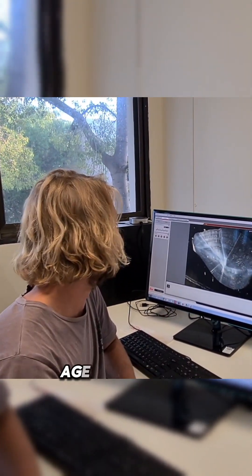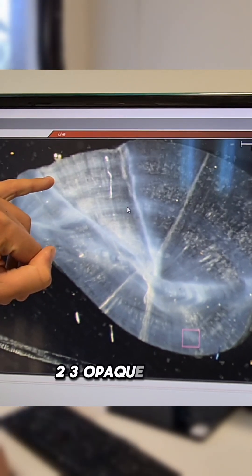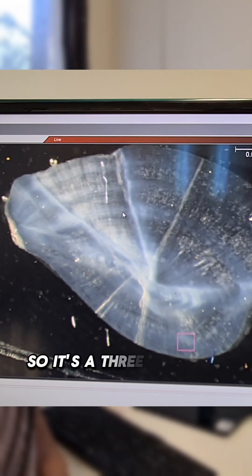We can use that to age the fish. And as we can see, this fish has got one, two, three opaque zones, so it's a three-year-old fish.